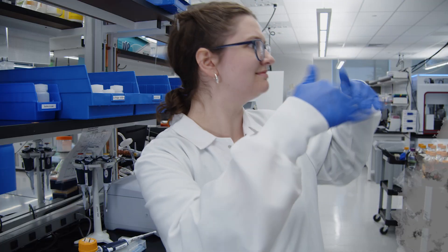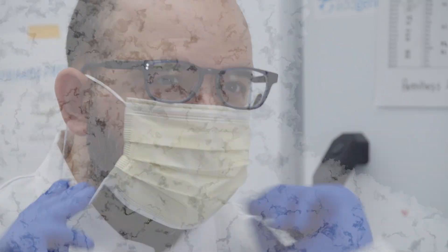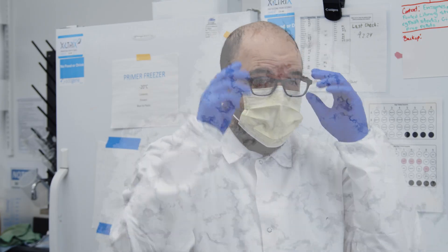If you're frequently seeing contamination in your samples, try adding disposable sleeves, a mask, or even a hairnet, even if it seems like you might not need it.